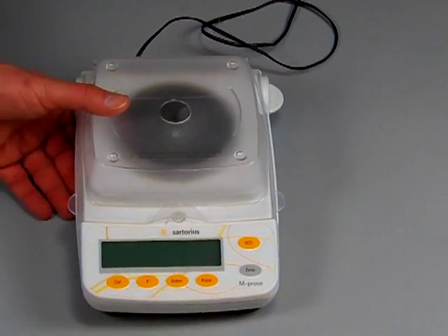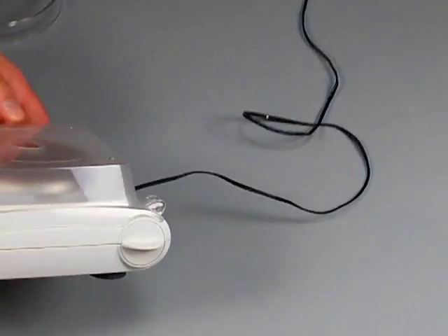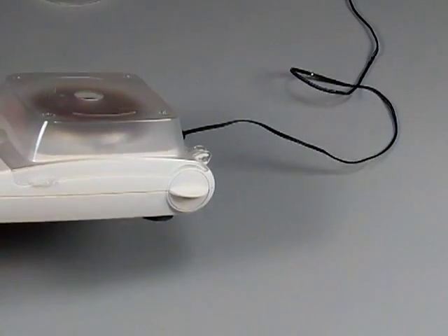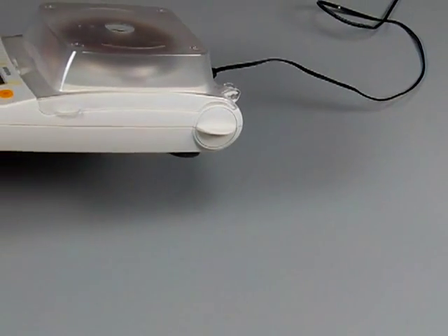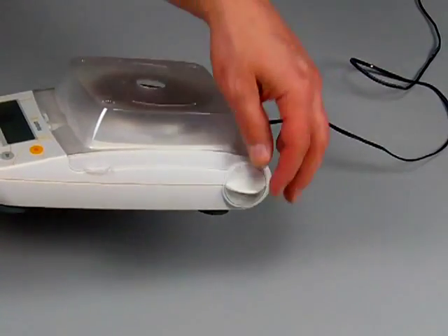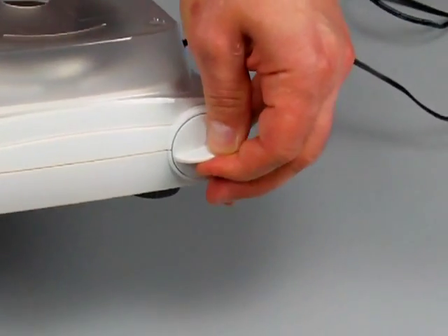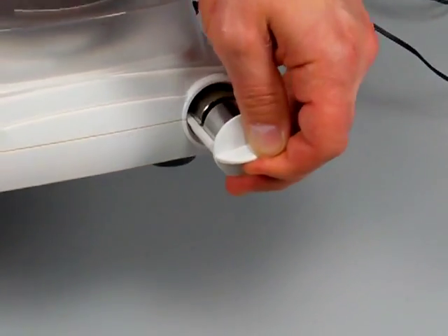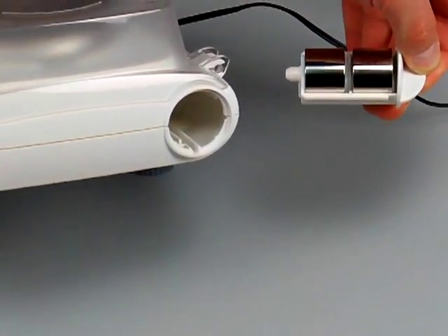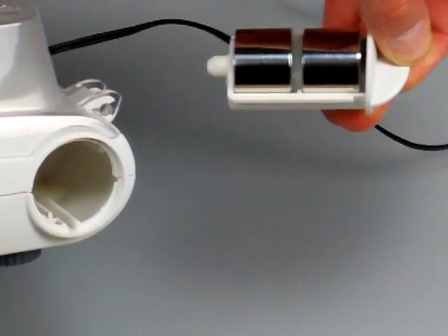We get a lot of phone calls when we used to sell the Vicons: where are the calibration weights? For some reason I've asked Sartorius and AccuLab why don't they put a little tag here so a customer will notice, but they refuse to do so. This is the compartment where the weights are stored. So we get a lot of phone calls: where are the weights? The manual says the scale comes with weights.